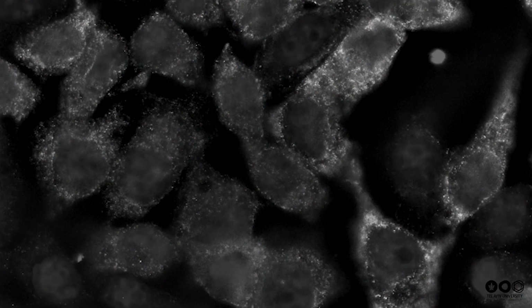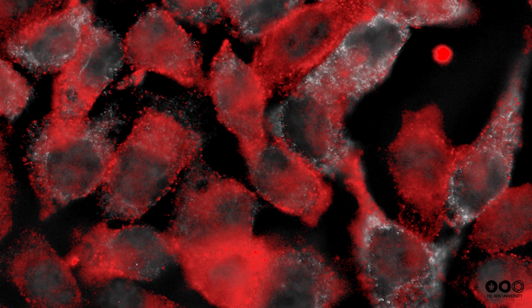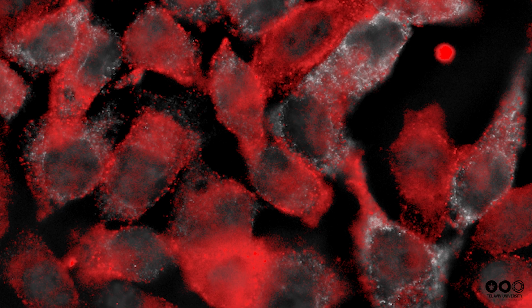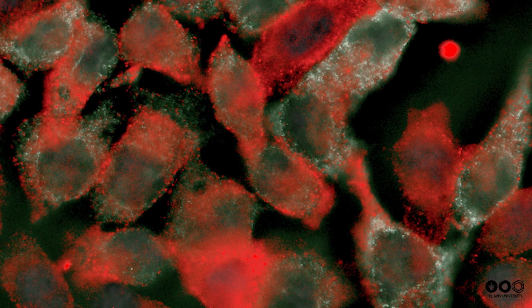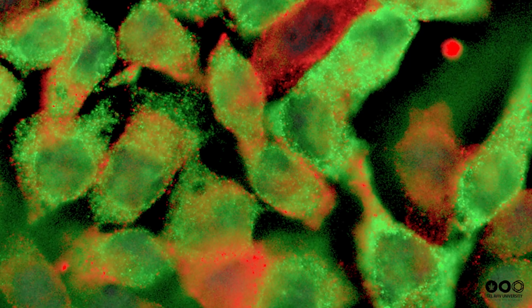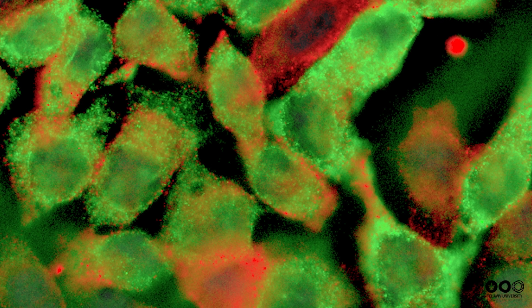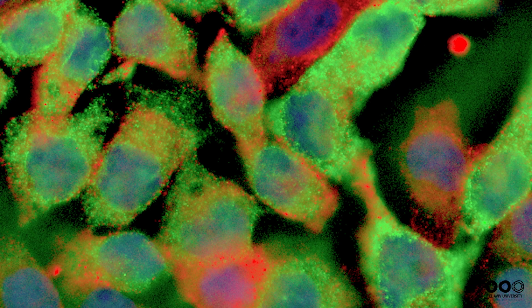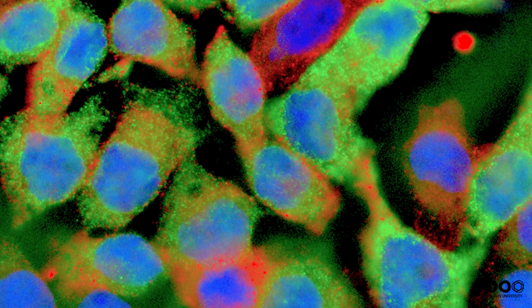Here in this micrograph, we see the boundaries of each cell by staining the outer cell membrane. Each cell contains an extensive network of intracellular membranes, the endoplasmic reticulum, stained in green. We can confirm the ghost in the center of the cell is the nucleus, the organelle that holds our DNA, the stuff genes are made of.